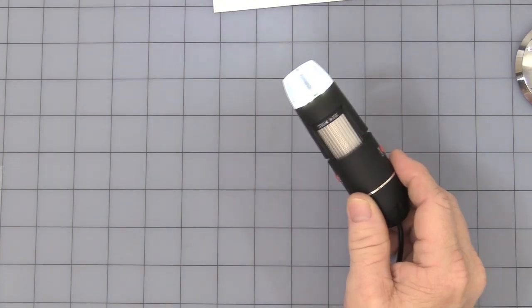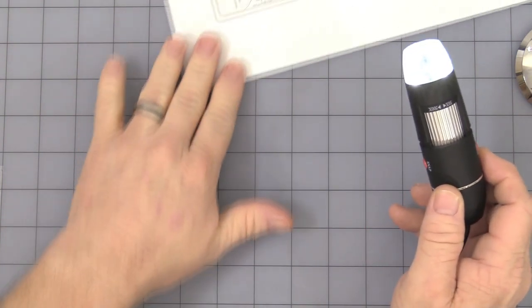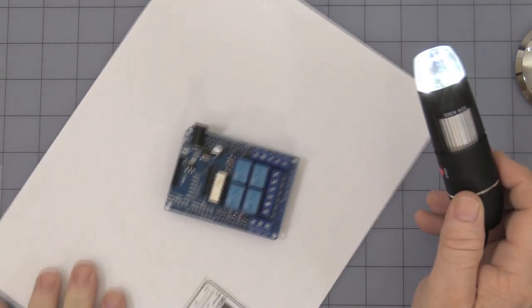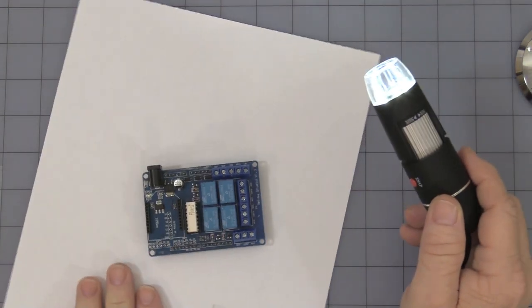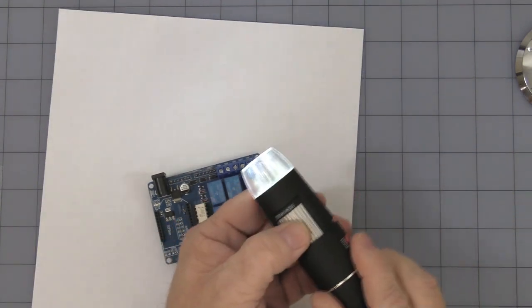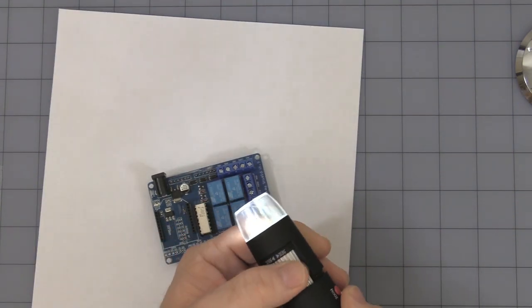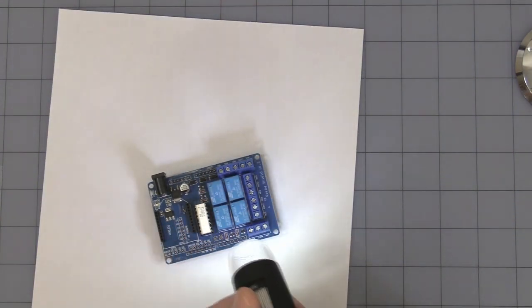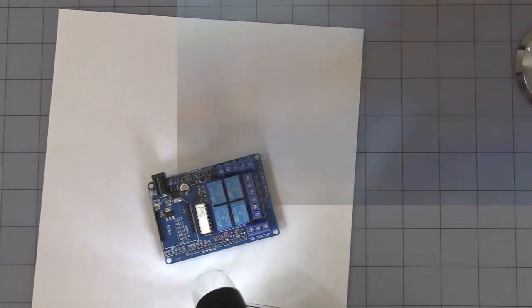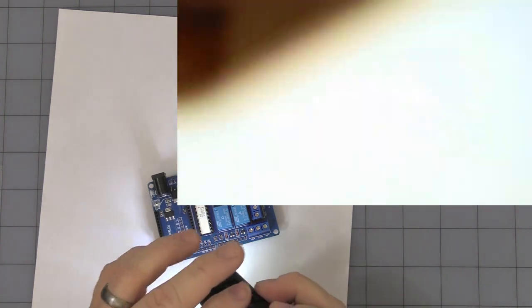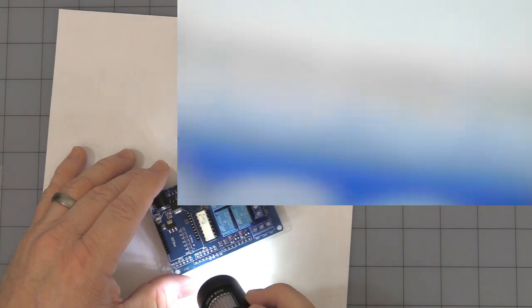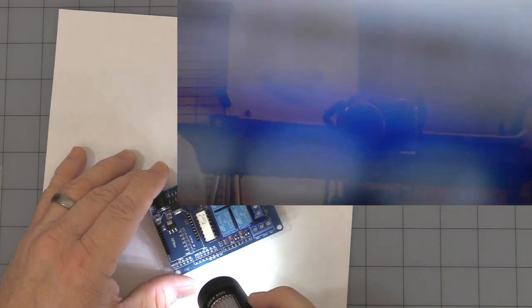Okay, let's try some real world applications here. I'm going to bring in a little piece of paper, because white seems to show it a little better. Let me get it down to lower magnifications. This is the lowest setting, let's see if I can get in here. I might bring in the zoom a little bit.